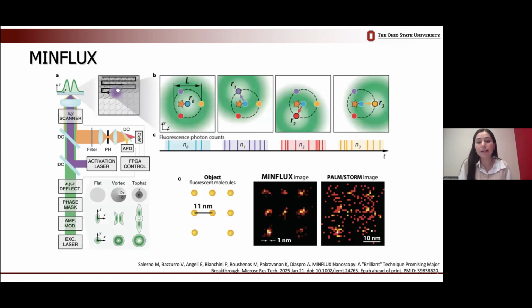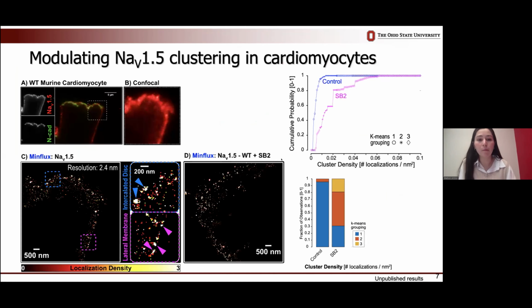MINFLUX microscopy is a new super resolution light microscopy technique that's capable of achieving 1 nanometer resolution. The way this technique works is there is a donut ring excitation beam, as shown, with a central intensity minimum in the middle. This beam will circle around the fluorophore it's trying to localize, and it will try to align the central minimum of this beam with the fluorophore localization. This is how this technique is able to precisely localize fluorophores while collecting minimal photon emission.